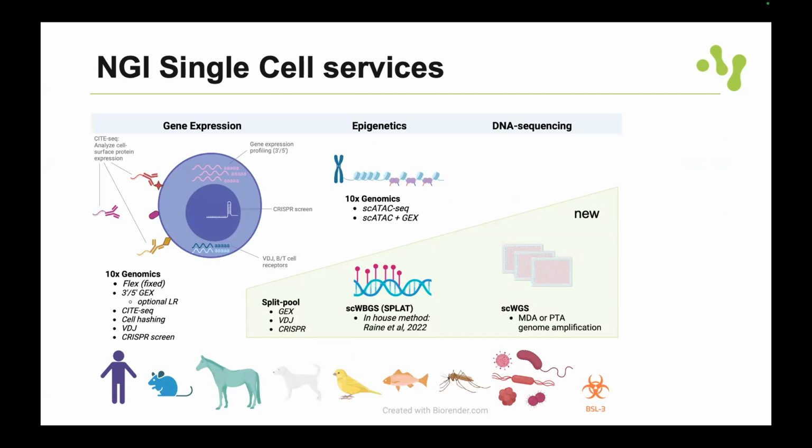We could optionally also do long read sequencing of the 10x libraries with Oxford Nanopore. Recently, we had Smart-seq3, which has recently been phased out. So the inventors also created Smart-seq Express and have this as a service company in Stockholm. So they are very efficient, and we shouldn't be a competitor to a commercial company. So reach out to them if you want to do Smart-seq.